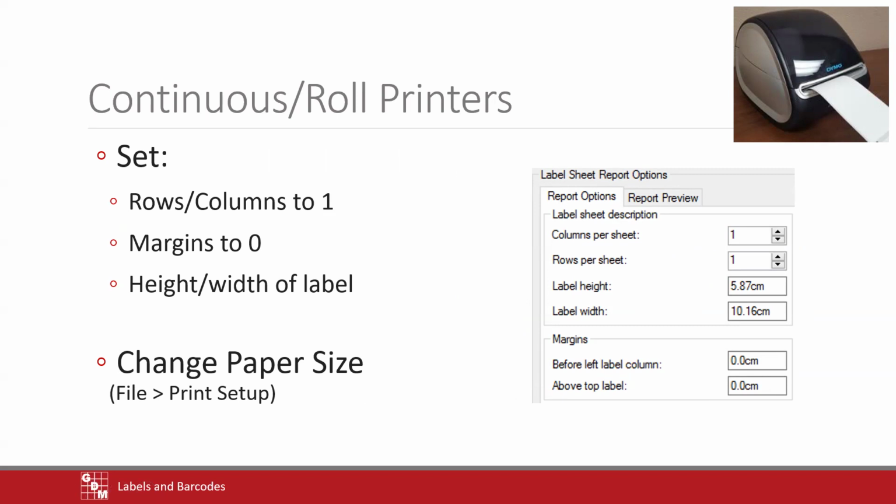One more topic here with the standard ones, just maybe a slightly different type of label that you could generate. So the last one is that one-page sheet. There are labels that are called continuous or roll labels. I've got a picture of an example here that instead of having that large document style, it actually just prints one label at a time. And of course, obviously it'll do 20, 50 all in a row. It'll just go boom, boom, boom, boom, boom. But it's just fundamentally different in the construction of that label.